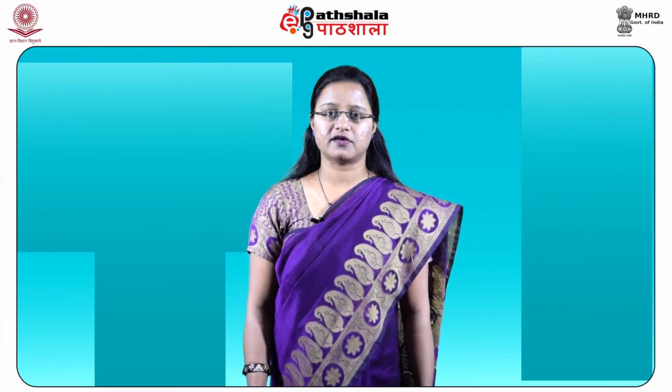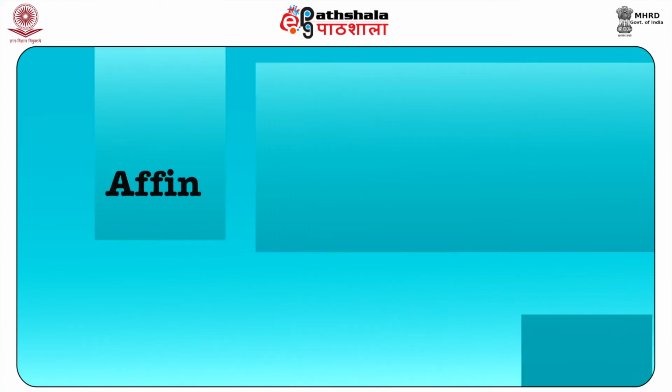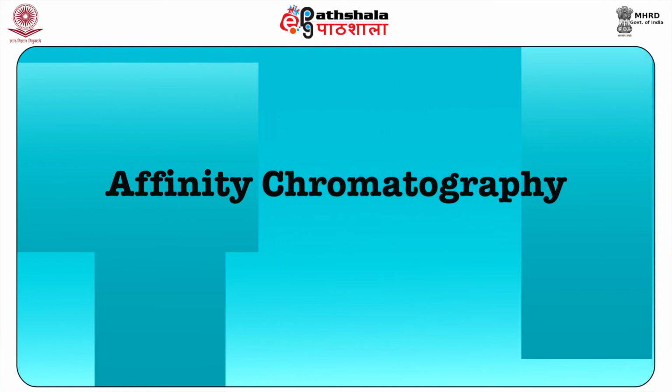Ion exchange chromatography, remember, is going to utilize the charge, while the one we learnt earlier, whether it is molecular sieve or we call it gel chromatography, utilizes the size of the molecule to be separated from the other contaminants or from the dialyzed protein. The next procedure which is generally followed is the affinity chromatography.